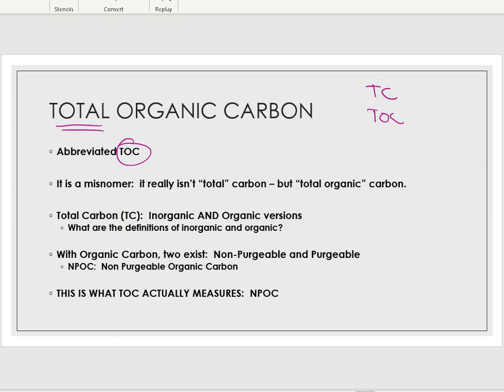And, you know, quite honestly, we also have IC, which stands for inorganic carbon as well, all right? So inorganic carbon is IC. The TOC is total organic carbon that we're going to be focused on. And the TC is going to stand for total carbon as a whole. And actually, the organic side of the house and the inorganic side of the house add up, and that is how you get your total carbon from a sample.